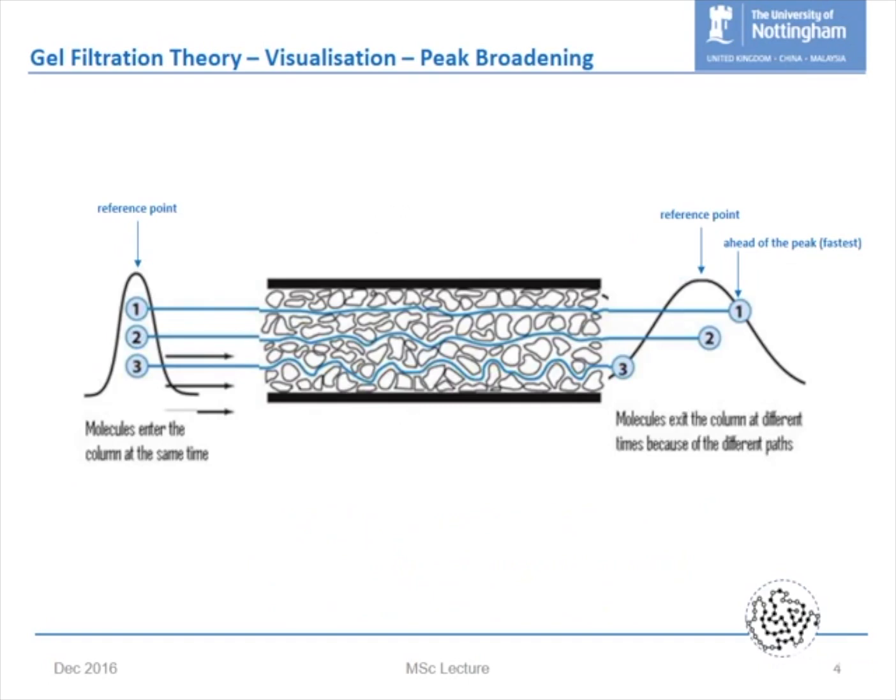Okay, so I think what I'd like to talk about now is just some of the parameters or properties that are relevant to doing GPC. And one of the things that we want to do, as I think I said earlier, is take a nice sharp peak like this, which is approximating to our injection, put it into a column, and have it interact with all the particles. We would like it to come out in a similar form but separated from a molecule that is similar.